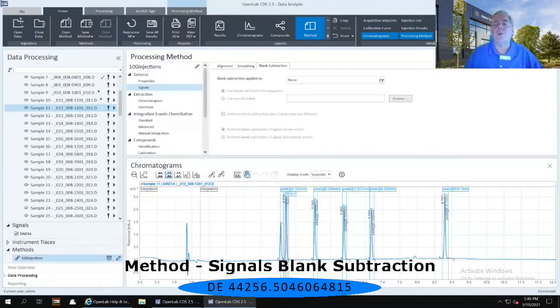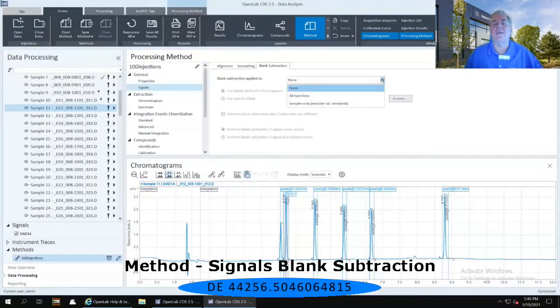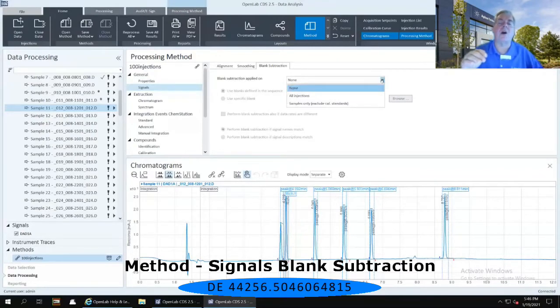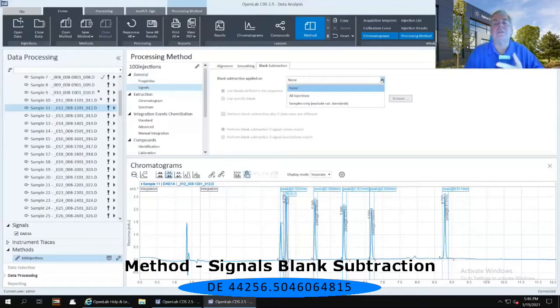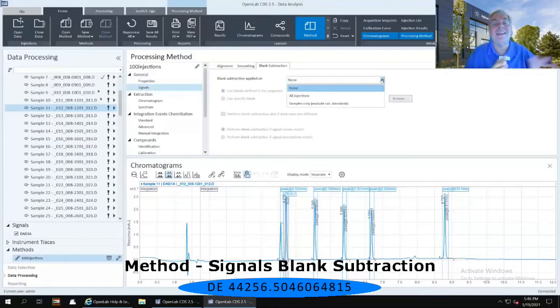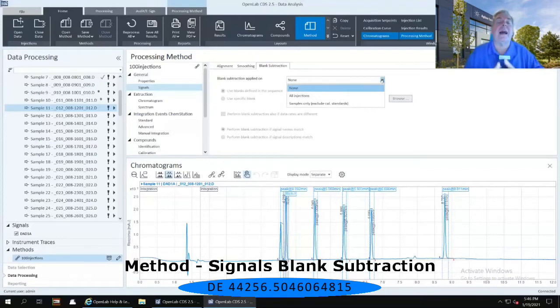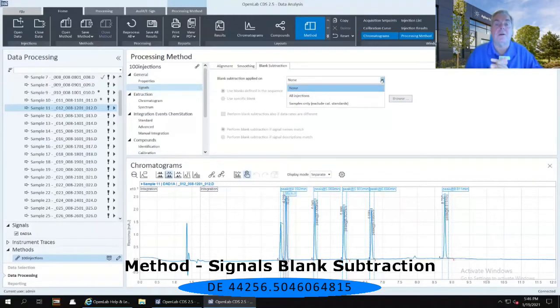If I use that pull-down menu immediately to the right of none, I can select that I'd like to do a blank subtraction on all of my injections, or I want to do a blank subtraction only on the samples, and it will then negate or pass over any of my calibration standards that might be there.